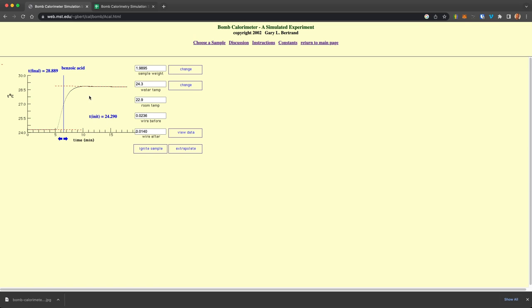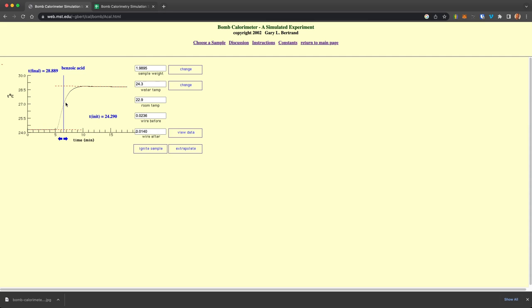Now, once you've done this for benzoic acid, this, as you'll see from the instructions, will allow you to get the heat of the calorimeter or basically allow you to calibrate the calorimeter for a specific bomb and a specific amount of water in there.